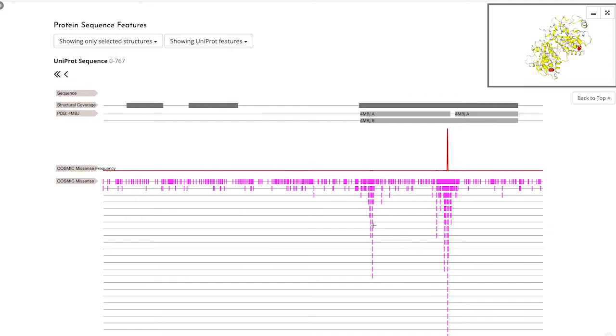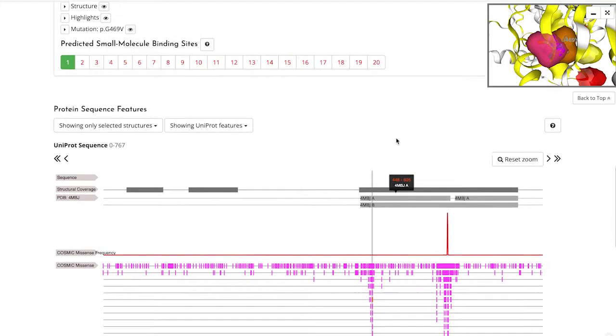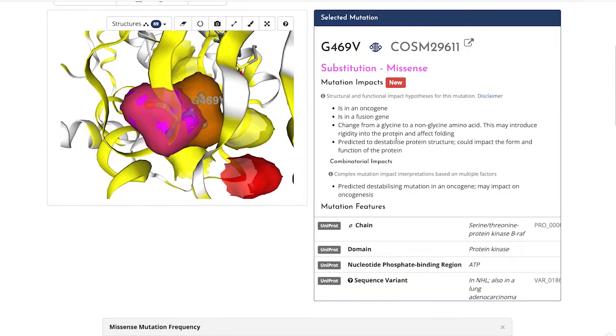You can then click to zoom in on a particular mutation, for example, G469V. If we scroll back to the top, we can see more detailed information and the potential impact of this mutation on the protein.